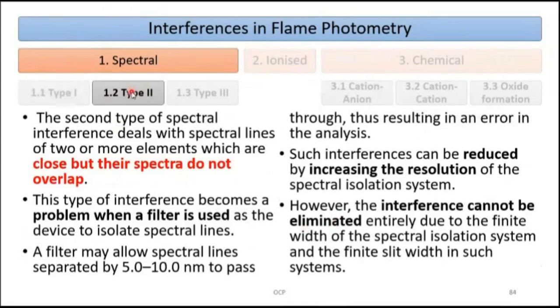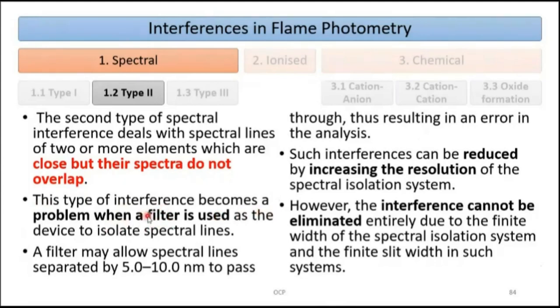The second type of spectral interference deals with spectral lines of two or more elements that are close but whose spectra do not overlap — this is related to resolution. The problem arises when using a filter to isolate the wavelength, because filters do not pass a very narrow band of wavelengths; the band is generally wider, so both lines pass to the detector.